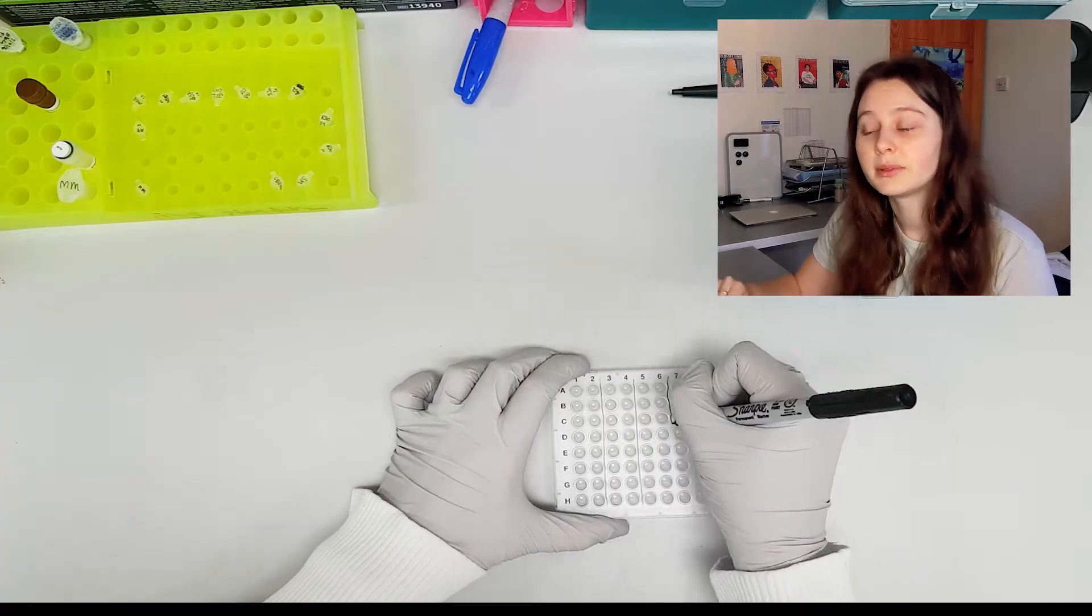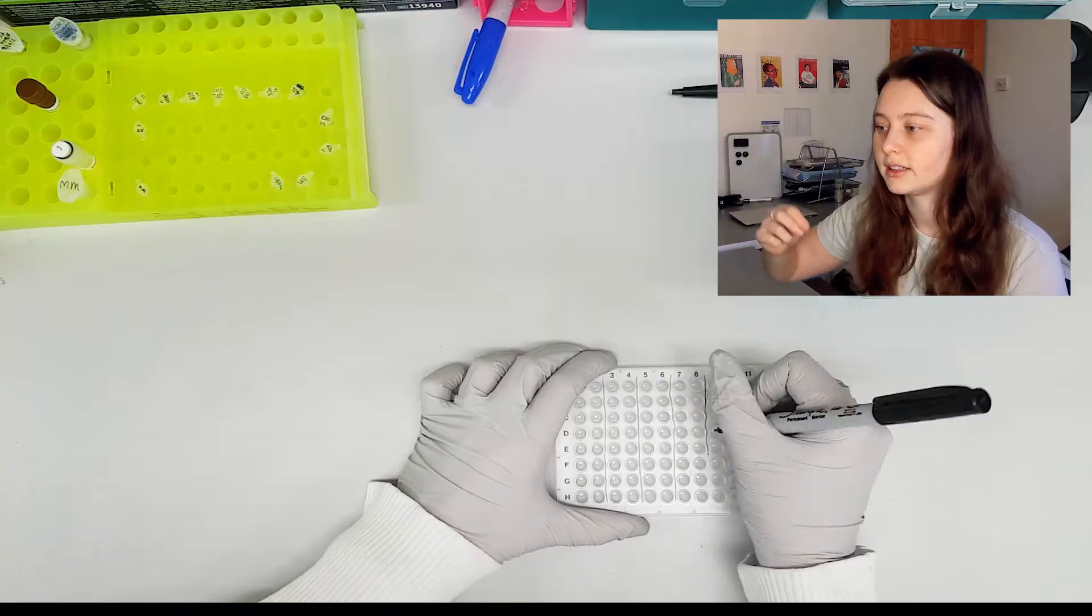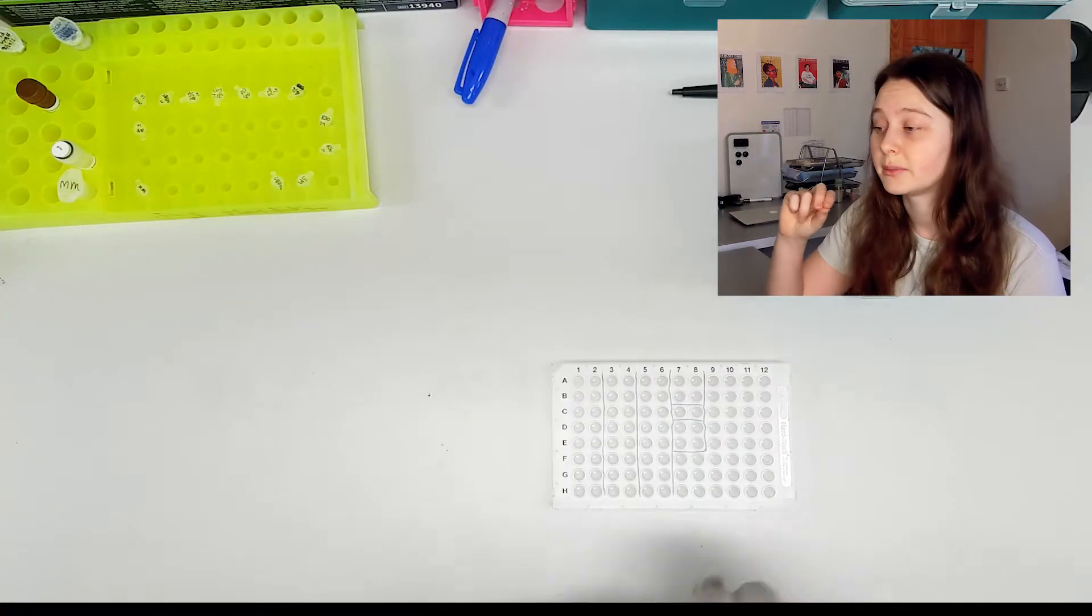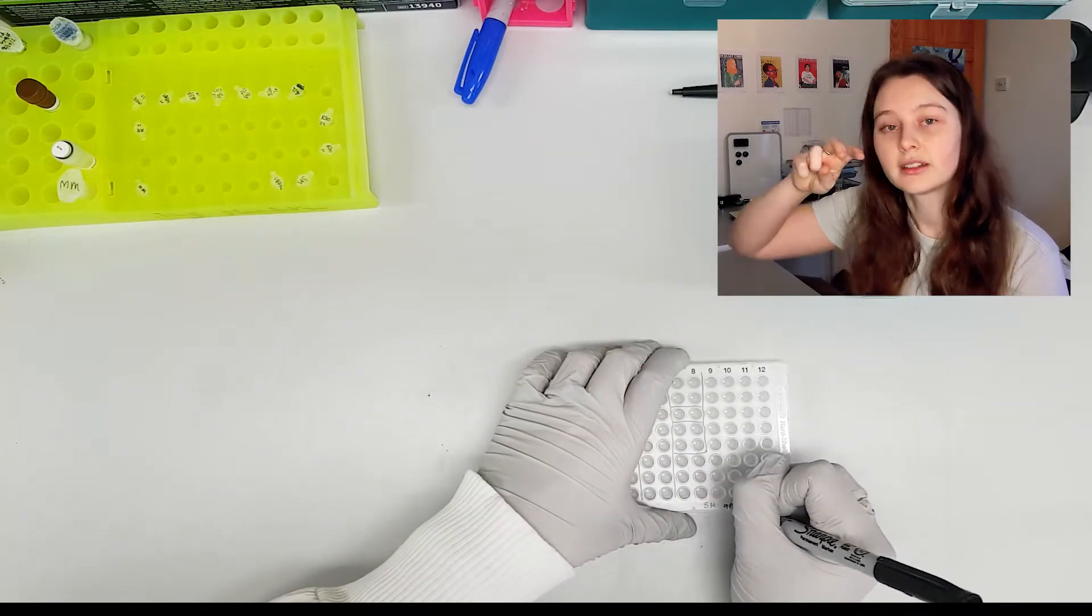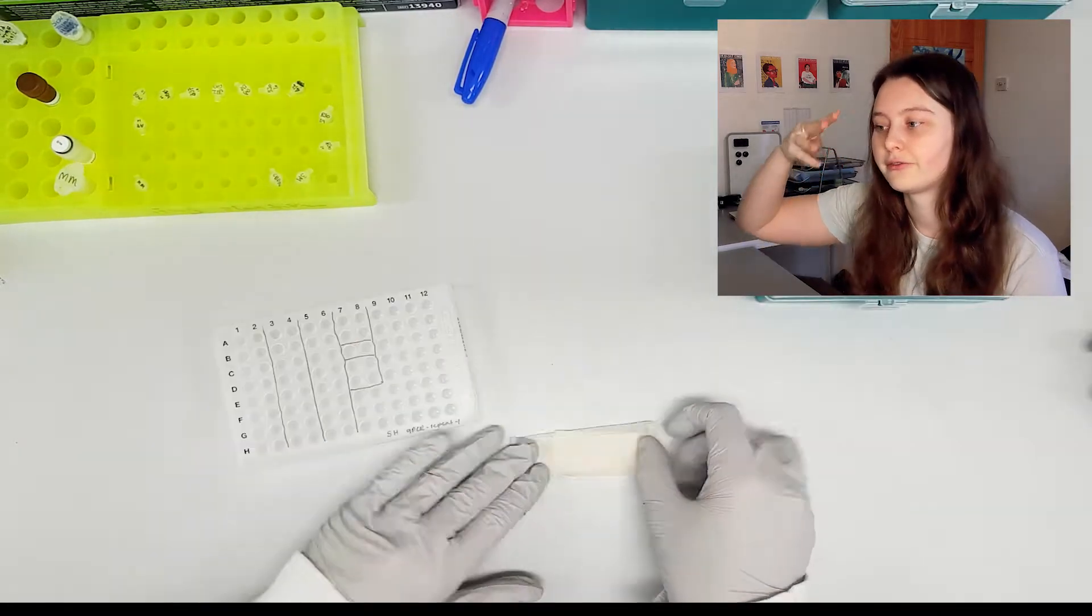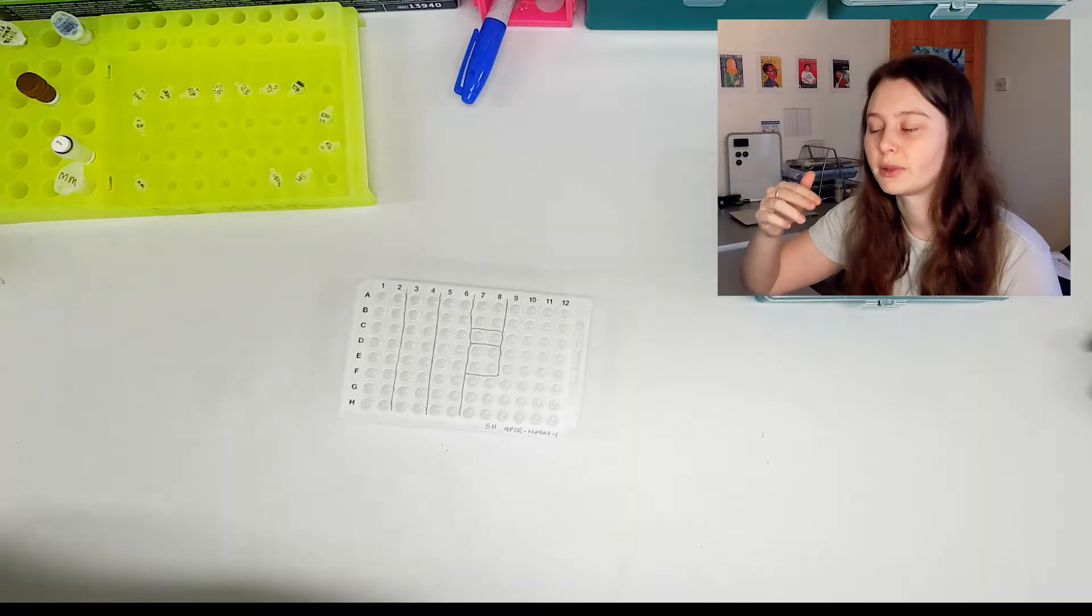So this is the qPCR plate and you can see that I'm lining out exactly where each of my samples is going to go. That little duplicate there is my negative control and the four in a box together are my two different positive controls.